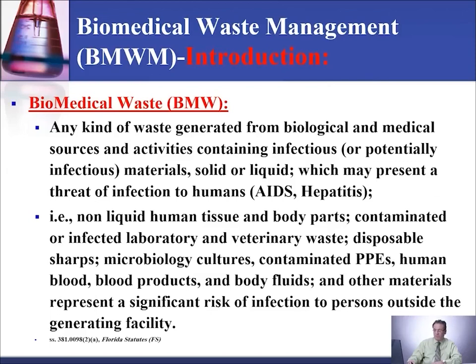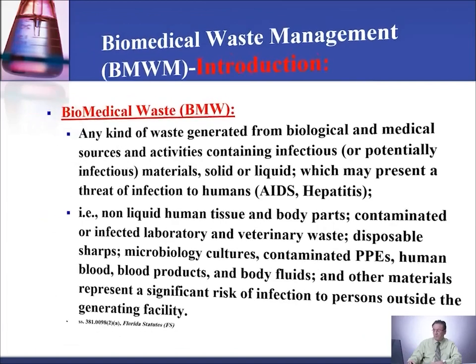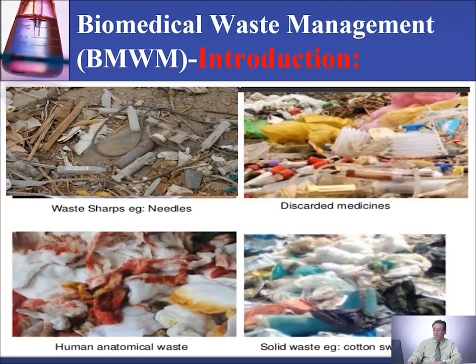Examples of biomedical waste: non-liquid human tissue, body parts, contaminated or infected laboratory waste, disposable sharps, microbiology cultures, body fluids, blood products. When we talk about biomedical waste, we talk about this stuff.